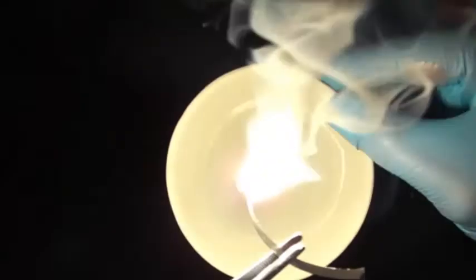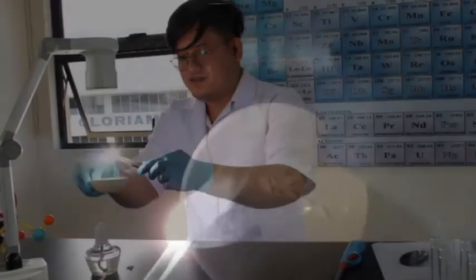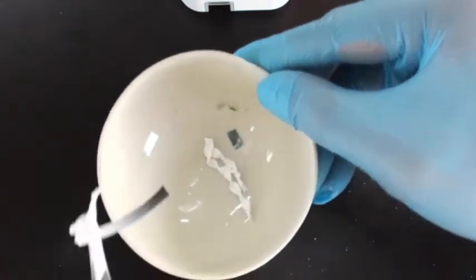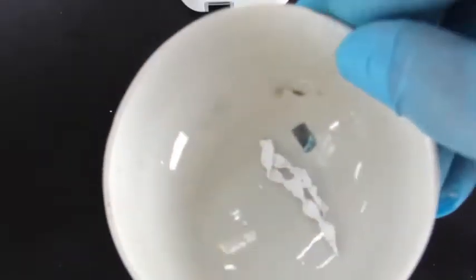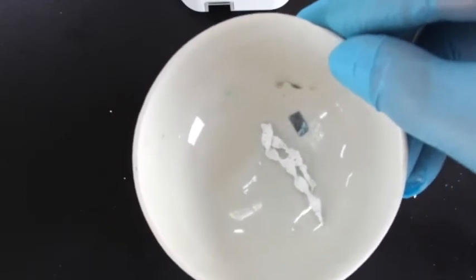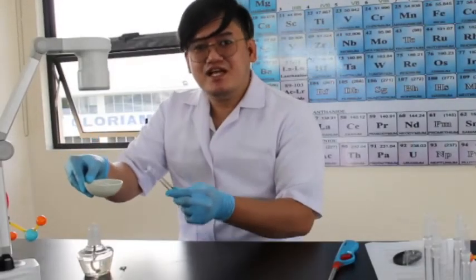I'll be placing this in an evaporating dish. There. So here is our starting material, and here's our finished product. Can you note any change that happened? So that's it, everyone. Lumos.